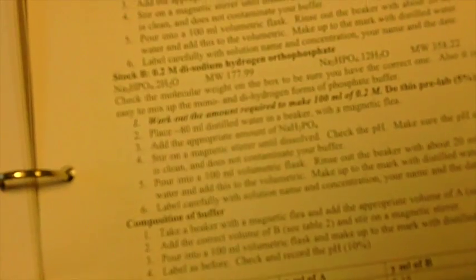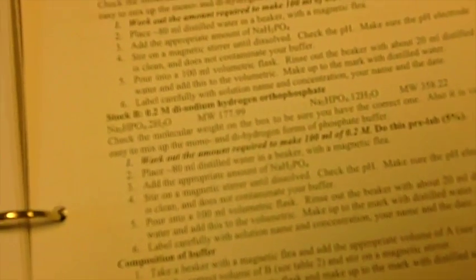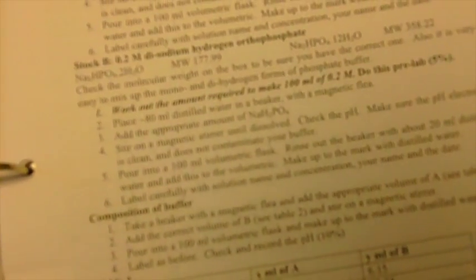So placing 80 ml of distilled water in the beaker with the magnetic flea, adding the appropriate amount of sodium salt, stirring and using the magnetic stirrer until dissolved, checking the pH, pouring into a 100 ml flask and making it up to the mark, labeling it carefully with the solution name and concentration, your name and the date.